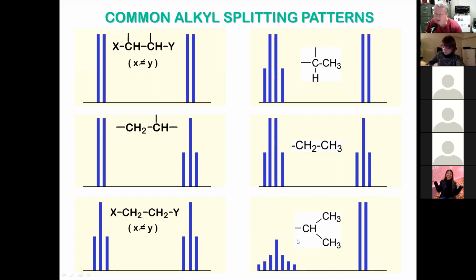What's this called? Anybody know? It's something propyl. Isopropyl. Why are we iso? Somebody asked a question. Sorry, that was me. For the one on the left in the middle, why are we not counting the methyls? The methyls? I see. All we're talking about is really just the CH2 and the CH. There's other stuff, but we're trying to just focus on two things. Okay, thank you.